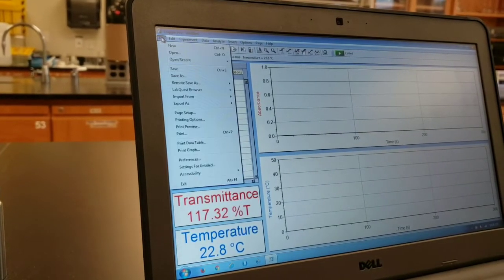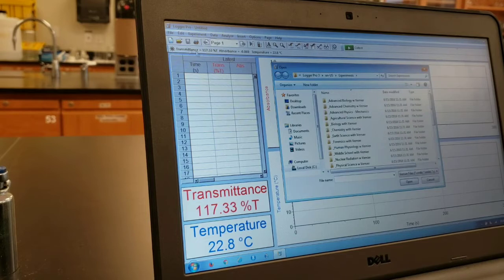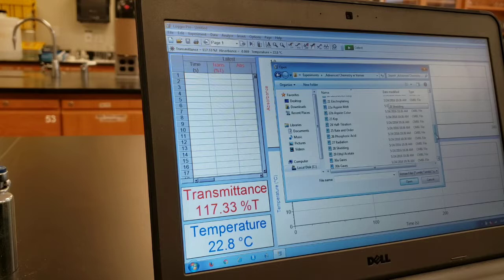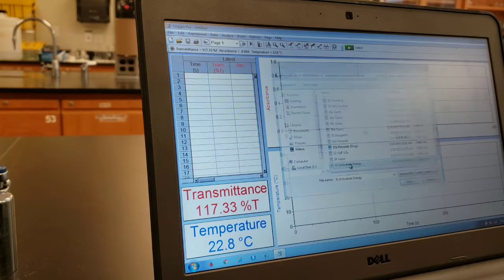Go to File, Open, and from the Advanced Chemistry with Vernier folder, scroll down to experiment number 35, Activation Energy.